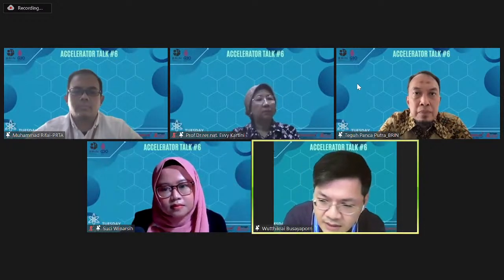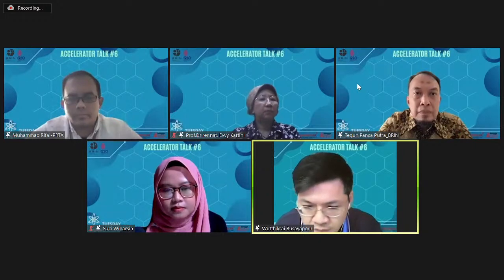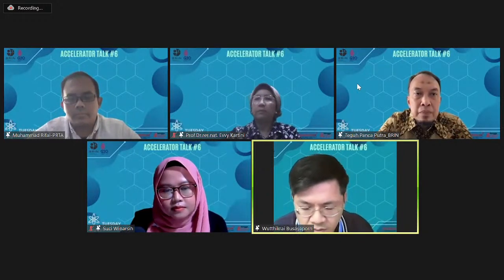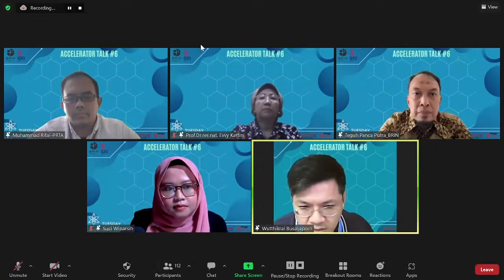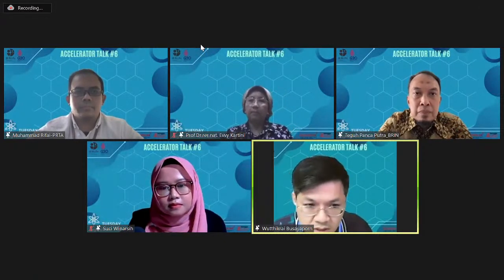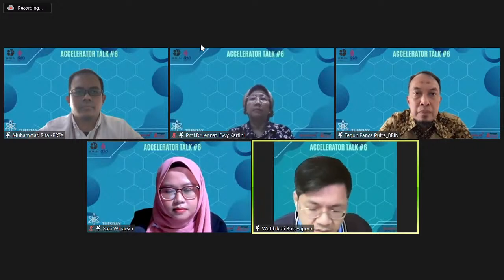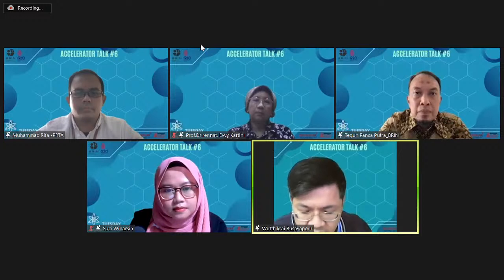Good questions. Previously, by close collaborations, I mean, if one of the persons in the synchrotron has a very close collaboration with someone abroad, they make an agreement to send the samples via mail, via shipping, and the person here does the experiment. That's a kind of close collaboration like this.